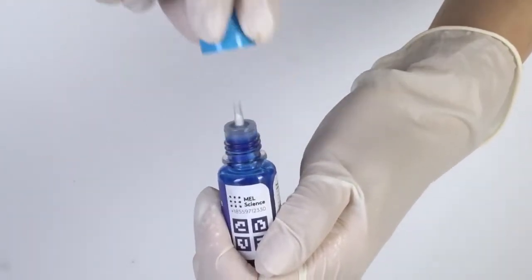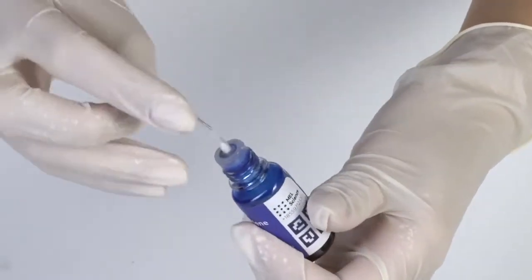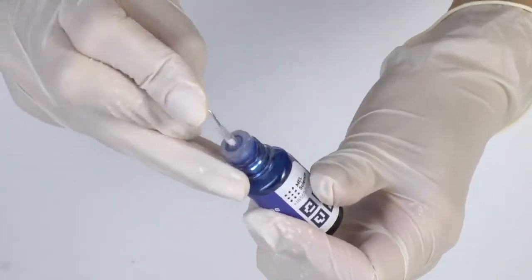To open a bottle with a reagent, push the cap and turn it. Pierce the bottle nozzle with an unfolded paper clip.